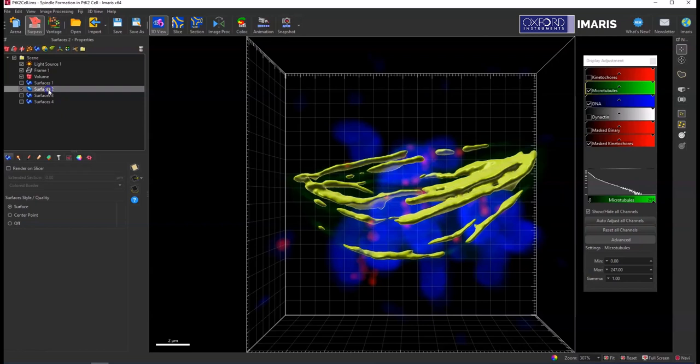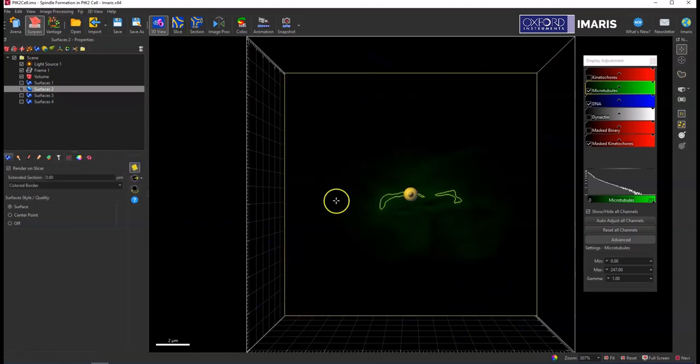The way you'll use this is click on this top button. I think it looks like a little yellow post-it note, and we'll switch to the slicer rendering button. It's really similar to what you can see when you use slice mode on the top versus 3D view, but it actually lets you see the outline of your surface object or your spots object or filament or cells object. Any of the objects, this will work on.